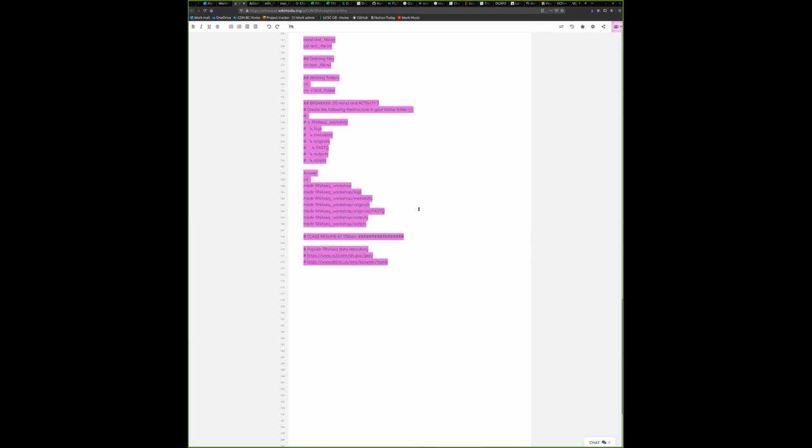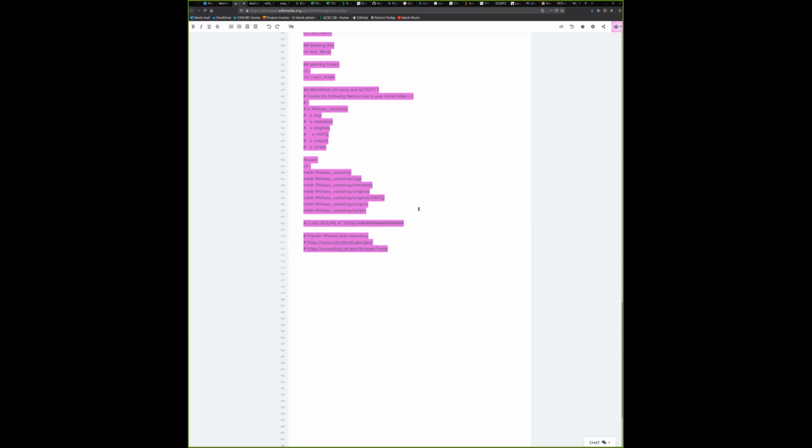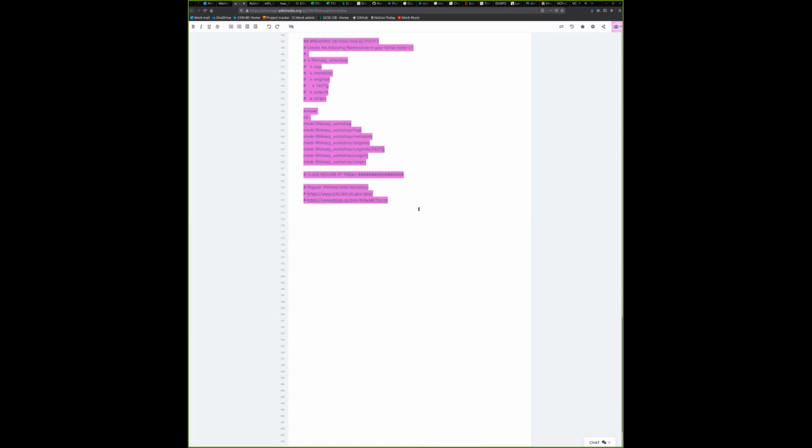We're going to move into RNA-seq proper right now, and I'll tell you that there are 2 popular repositories that store RNA-seq data. One of them comes from the NCBI. And somebody just erased. Why did you erase? No, I'm just joking. I'm going to paste this again. So back on Etherpad, there are 2 repositories with links to the repository. One of them is NCBI.